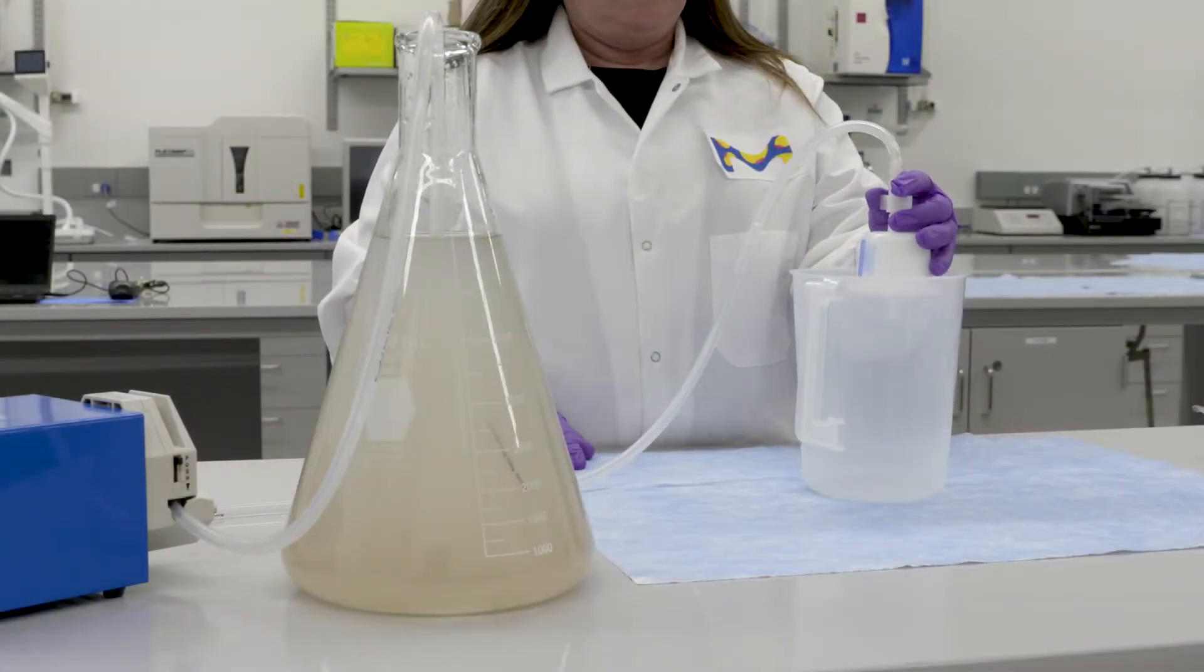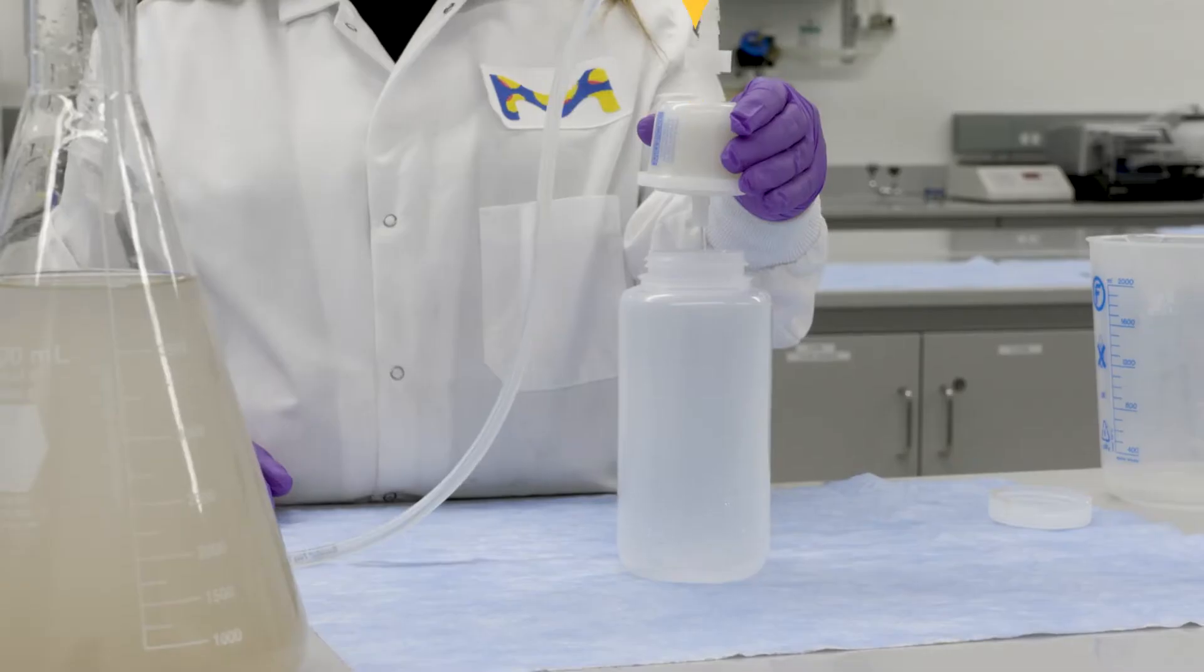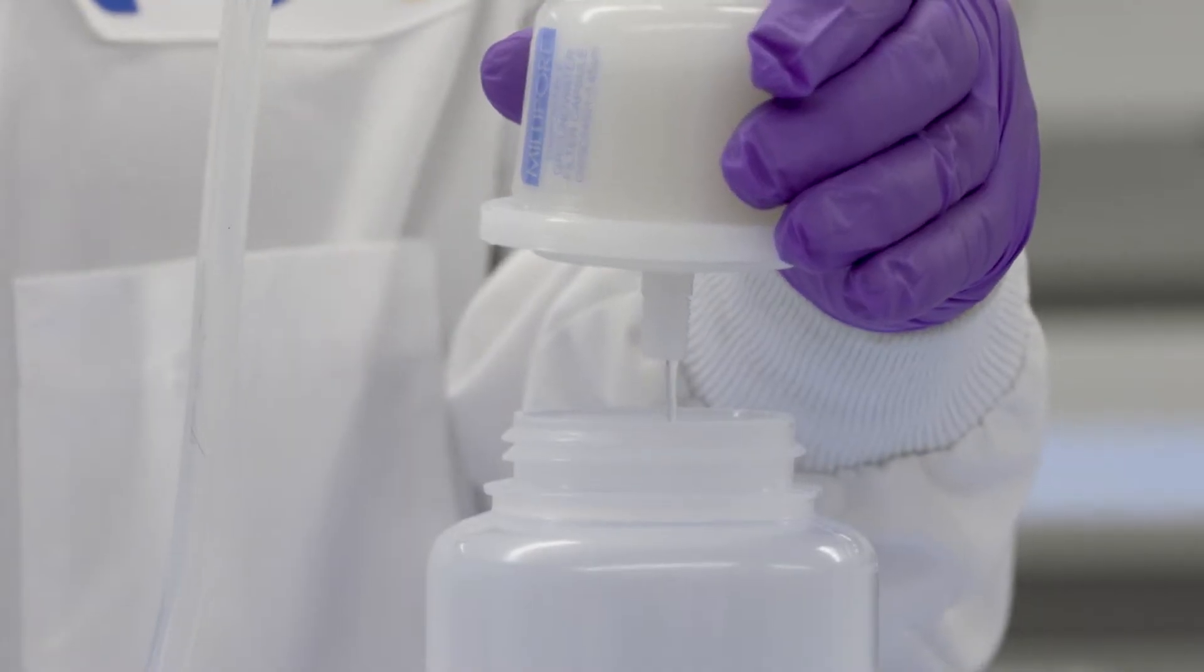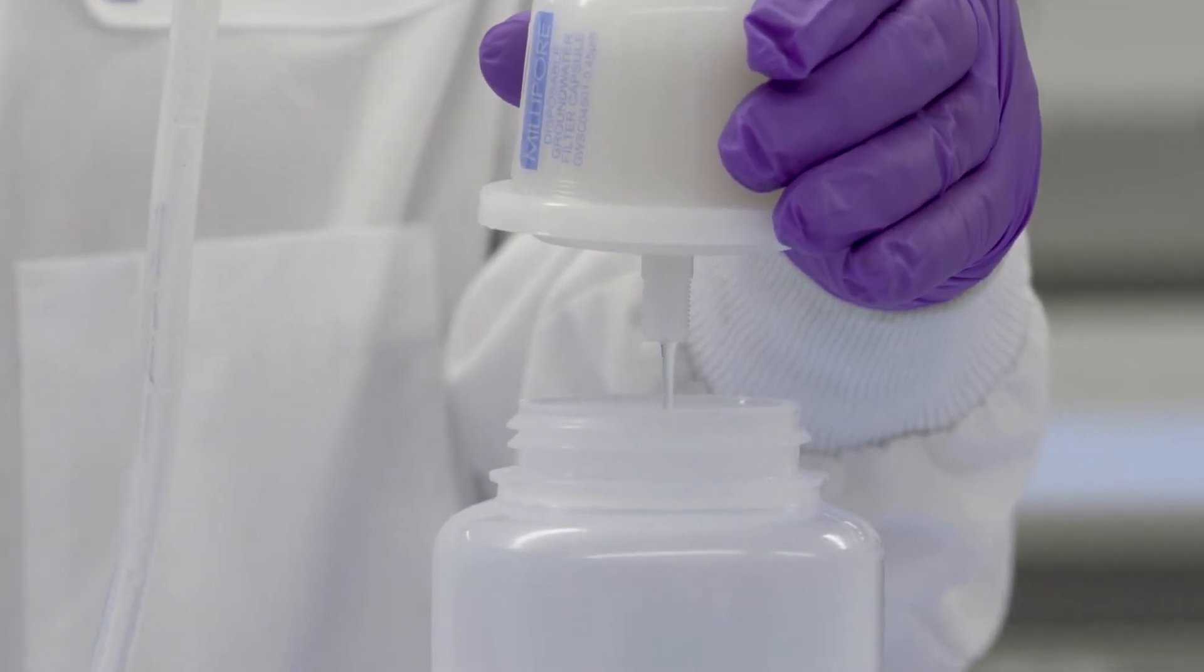Source groundwater enters the unit, travels through the pleated membrane which traps and retains particles greater than the rated pore size, and the filtered groundwater exits through the outlet port.